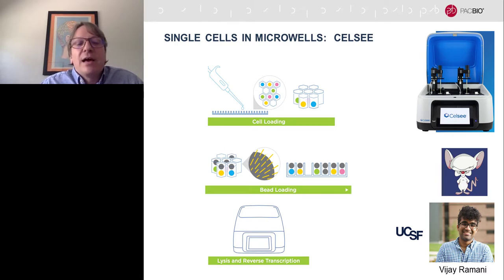So finally, I want to go over some of a really recent collaboration we've been doing with Vijay Ramani's lab at UCSF, and that's to evaluate another platform for performing single-cell RNA-seq. And so again, this is one that's been traditionally associated with the short reads, but we thought since this has a similar mechanism of the template switch oligo, we could try and see, could this also be adapted to long reads?